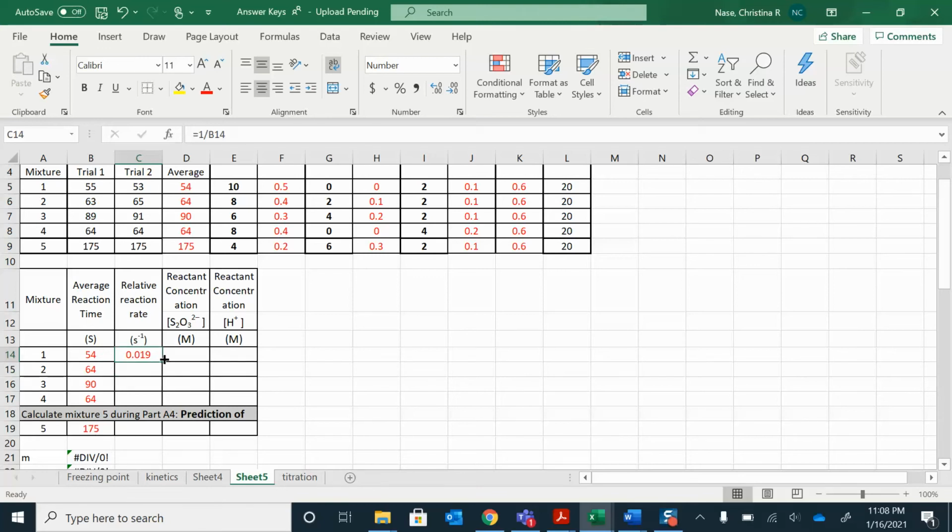And I'm going to drag that down. Boom. And this one's a little weird. 1 divided by time. Only weird because I have this thing here that's not letting me drag copy my equation down.